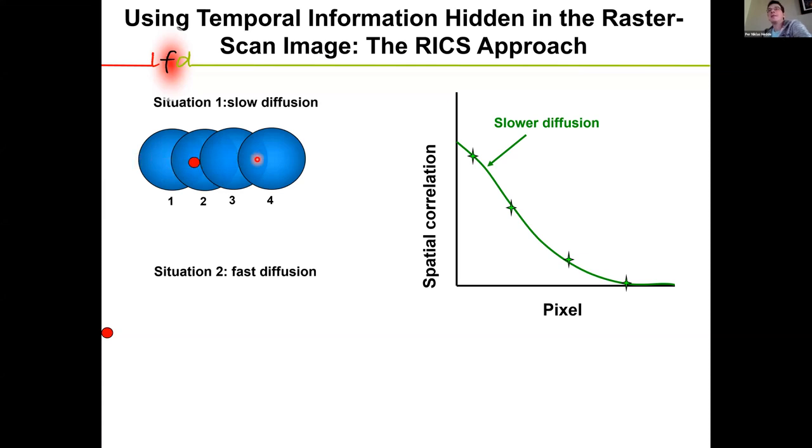But the laser beam scans at a constant velocity, whereas the diffusion only goes with the square root in case of free diffusion. So if it's slow, at some point the laser beam will always overtake the molecule. So we may get a signal in the second pixel and maybe the third, but not pixel number 4 and so on from the same molecule.